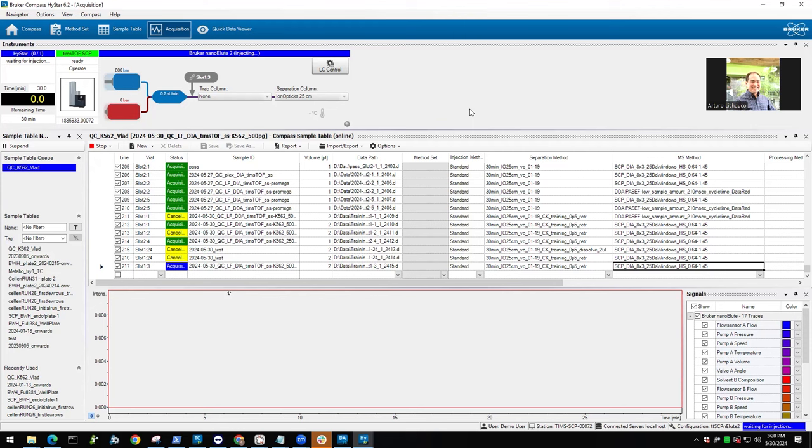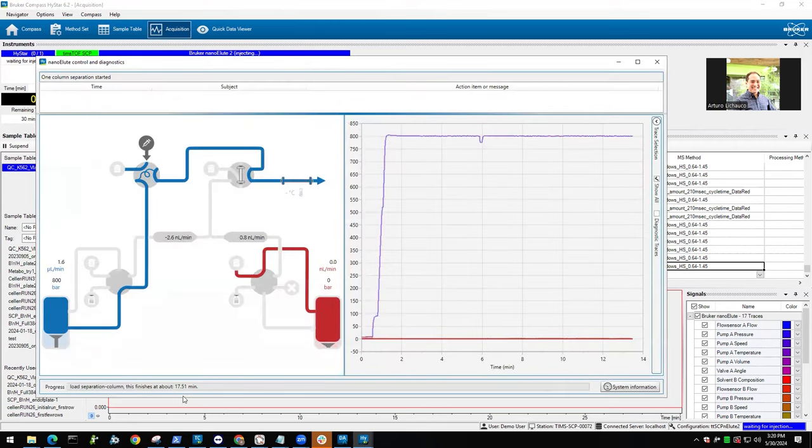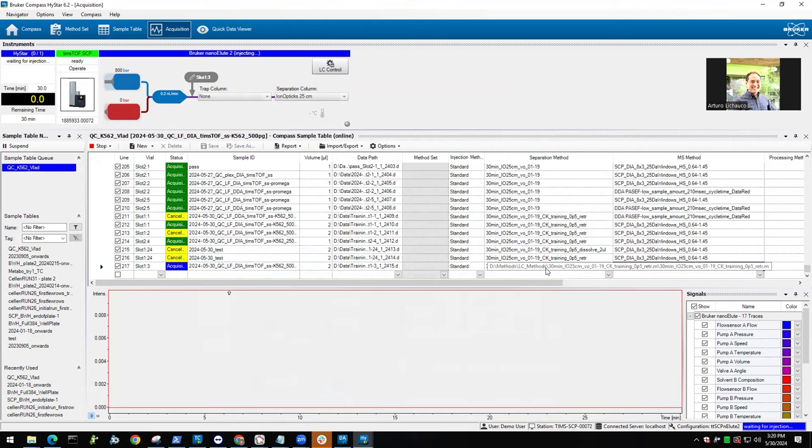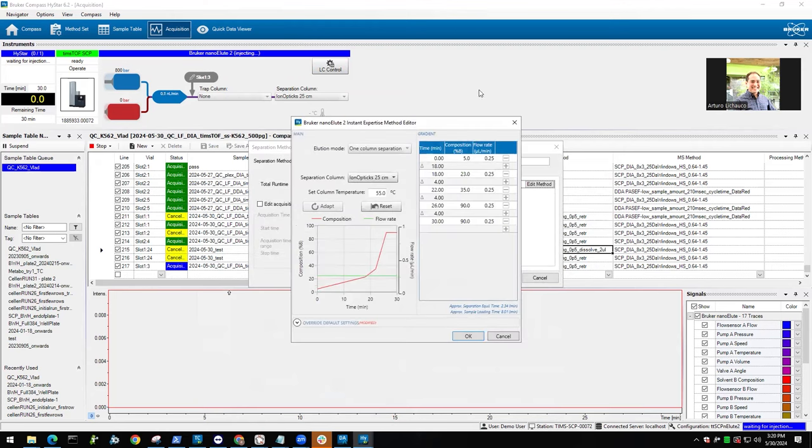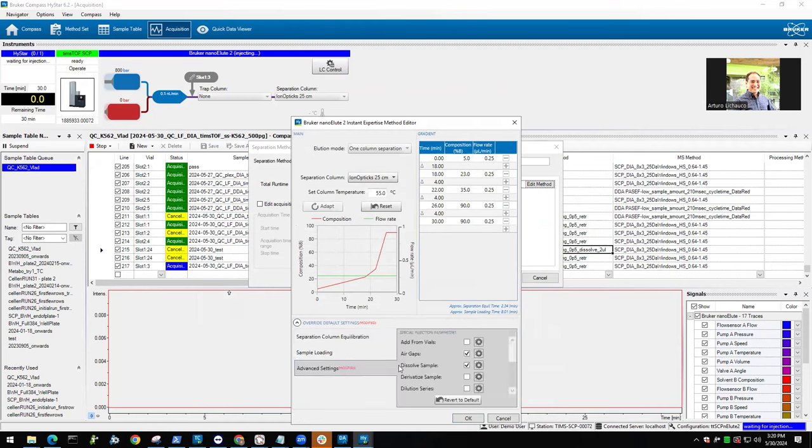While the sample is being injected, it is almost done. I just want to show this whole sample method. In terms of what we specify here, everything is the same. The only thing we change is in the advanced settings, we activate the dissolve sample functions. There's also derivatize or dilute, so you then have a higher concentration, take the volume, put it into a certain vial and dilute it with certain buffers to get a lower concentrated sample, for example.